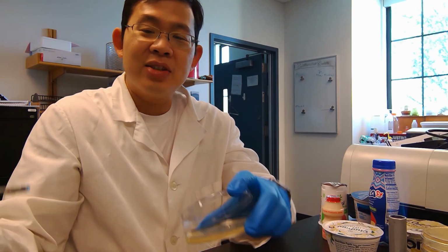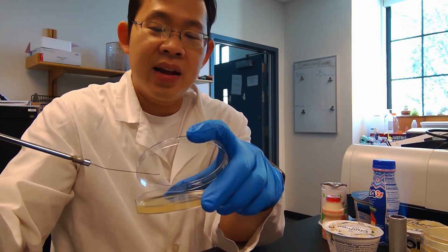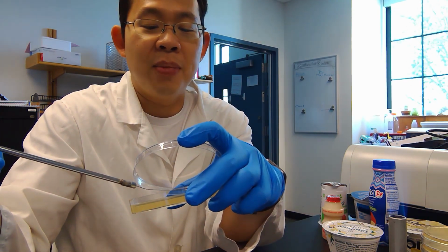One way to do that is to wait around, but sometimes time just flies by and it's a waste of time, right? So if you are impatient, you can touch your hot loop onto an area of agar where you believe there is nothing, where you have not deposited any cell.